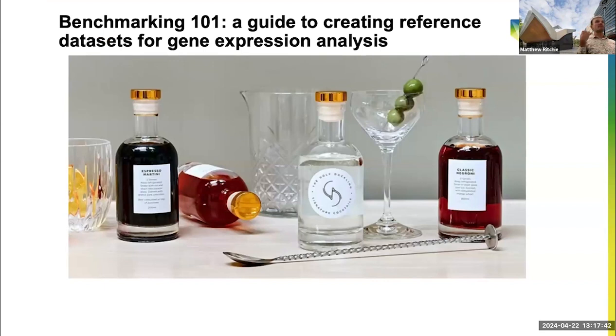The final thing is the concept of dilution. So you could, is there a shot glass there? Well, you could pour in neat, or you could then make a 50-50. And again, that's another situation where everything across the series of samples you might make for your reference is going to go down systematically, depending on how you make it. So those are the three elements.